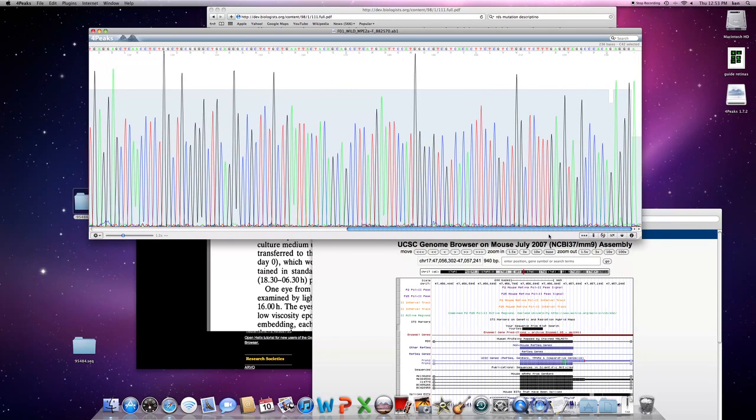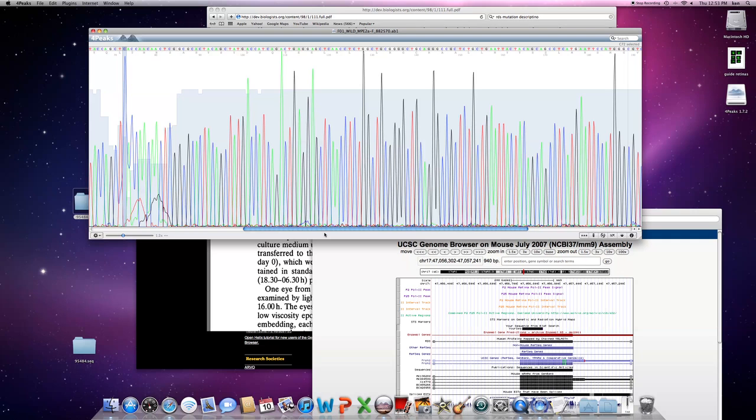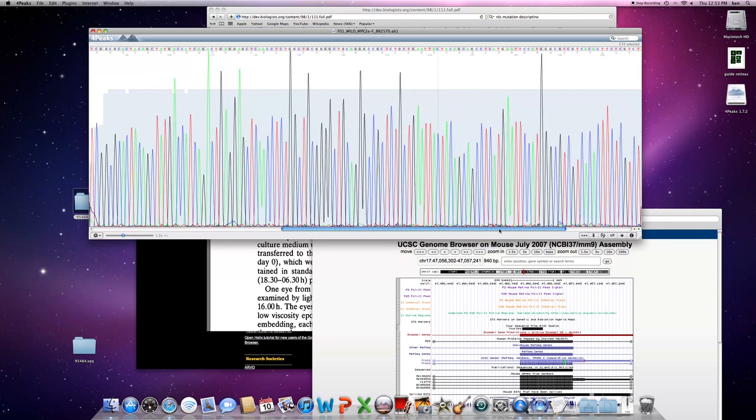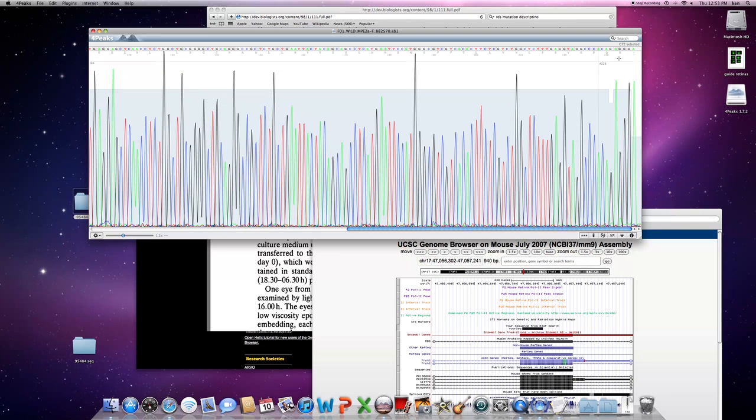And normally you would look through here. This is a PCR product. It's not too long a PCR product, so typically the sequencing will just get right to the last base, hit the end of the DNA, and so this one abruptly ends with an A. So this would be a good sequencing file. There's mostly baseline separation as we go through all the bases here, and you can see this product is really just over 230 base pairs, but this is simply how you can view it.